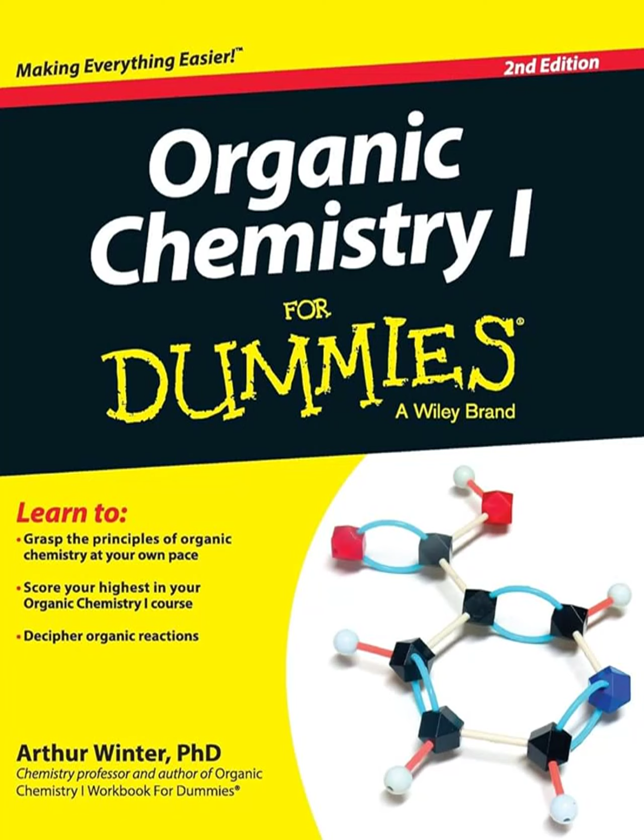Let's do it. So, every good detective starts by sizing up the scene. For NMR, that means gathering our first crucial pieces of evidence. What kind of clues are we actually looking for? How do we kick off the investigation? Okay, so our approach is very systematic. It has to be, really. And it's adaptable, too. Adaptable how? Well, you might get different kinds of NMR problems, right? Some give you just the molecular formula and the proton NMR, the 1H spectrum. Others might throw in IR, maybe a mass spec, or even a carbon-13 NMR. Right, more clues. Exactly. Our method lets you use whatever clues you're given.